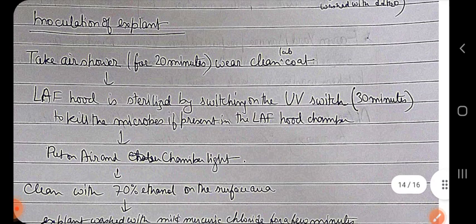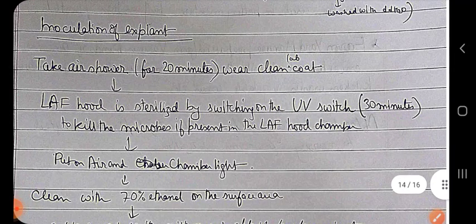Then comes inoculation of explant. How the explant is inoculated into that medium. Okay, now for inoculation of the explant, those who are preparing to inoculate the explant in the culture vessel containing the sterile media, first we have to take an air shower. Now this is an easy job. The air shower is a very easy job.